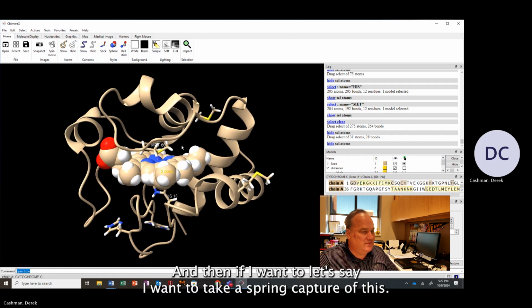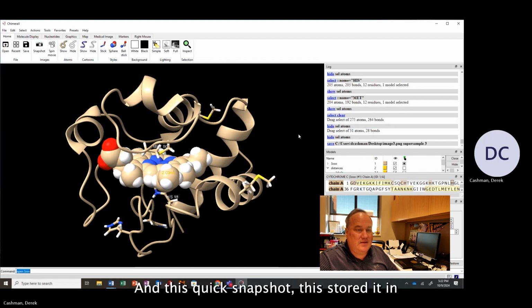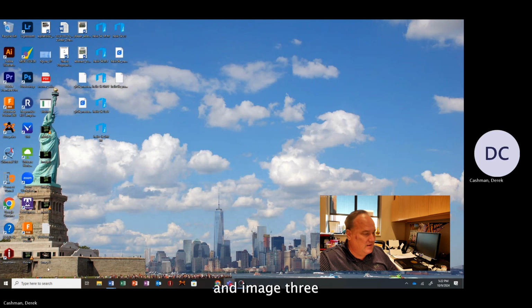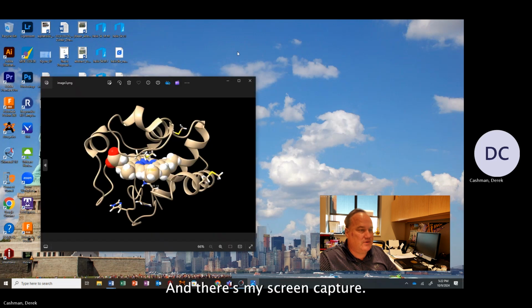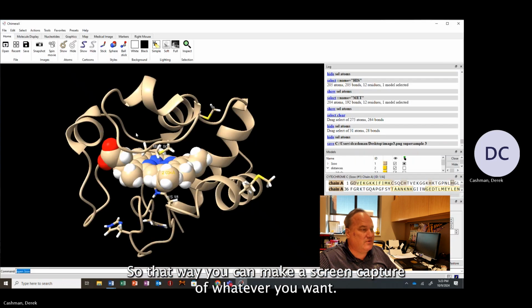And then let's say I want to take a screen capture of this, well, I can make a snapshot right here, right? And I just click snapshot. This stored it in C:, it stored it in my username right on my desktop, actually. And it named it image3.png. So now I can go to my desktop, and image 3 is right here, right? And there's my screen capture, right? So that way you can make a screen capture of whatever you want.